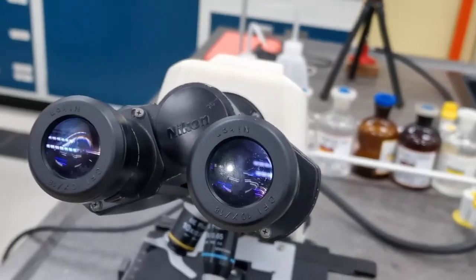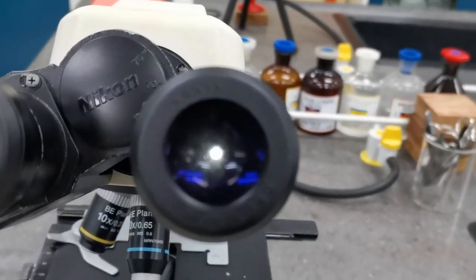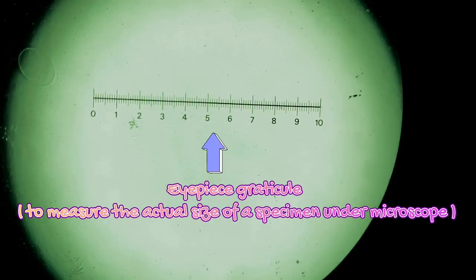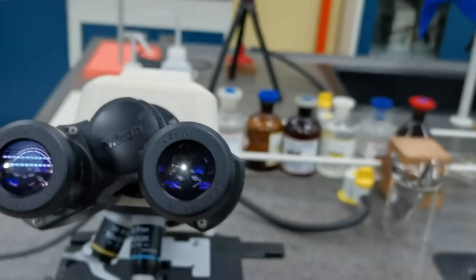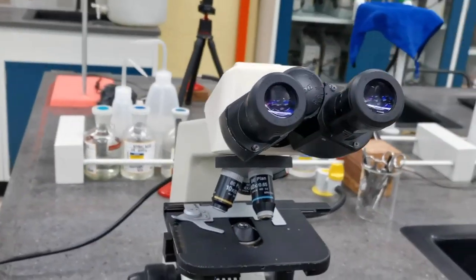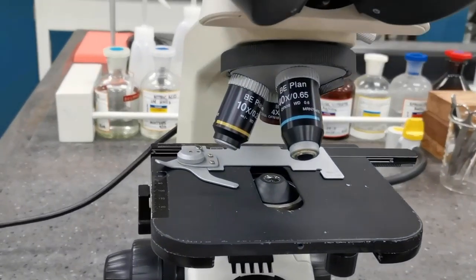Looking into this lens you will find a little scale called the eyepiece graticule. The eyepiece graticule is a scale which we use to measure the actual size of a specimen. The technique to calibrate this eyepiece graticule will be discussed in a separate video. Moving away from the ocular lens, we will now reach the objective lenses.